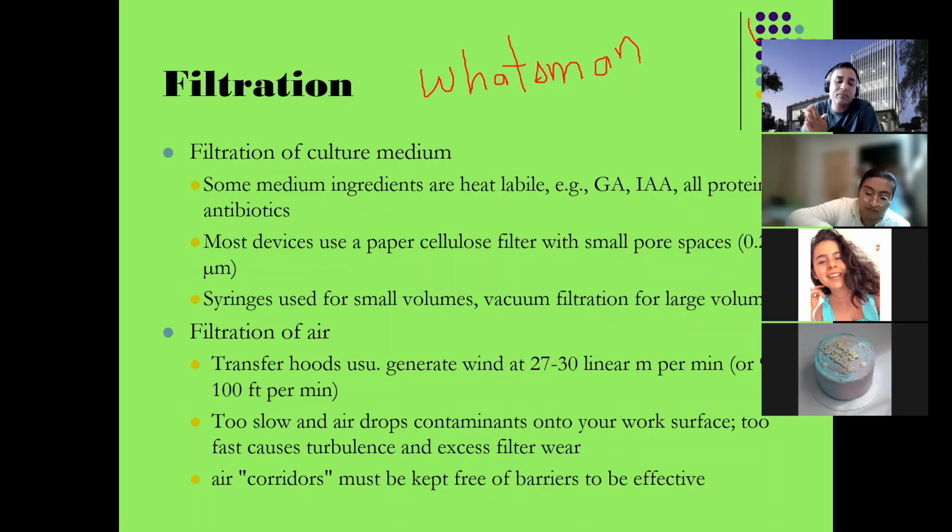You can sterilize anything you want that is liquid and heat sensitive. Solutions like vitamins, hormones, and phytoregulators are the main compounds sterilized by filtration. That is very important. You cannot autoclave or heat them; above 40 degrees centigrade they will degrade and lose their functionality. So that is the filtration of liquids.